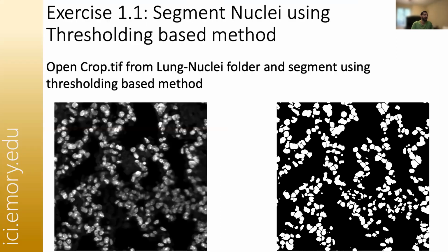But what if you have nuclei from models such as an in vivo data set, right? This is from lungs. What you can see is that when you get into in vivo data sets, the nuclei are dense and touching each other. They have got different features, they've got all of these dots. Some of the nuclei are even very different than this, and that's something which is part of the liver data set.